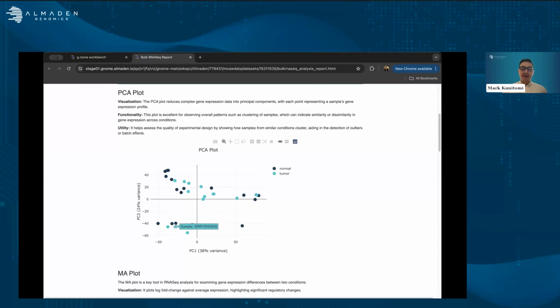And so data coming from this sequencer, from this person who processed it, is more similar to itself than other data sets within our sample. And so we really need to be able to overcome this technical noise. Otherwise, it's going to lead to spurious comparisons for us identifying those downstream biomarkers.